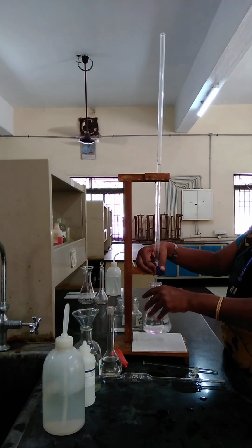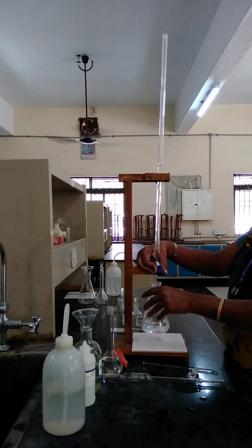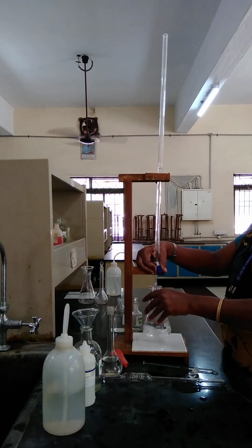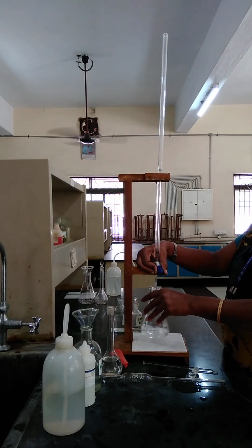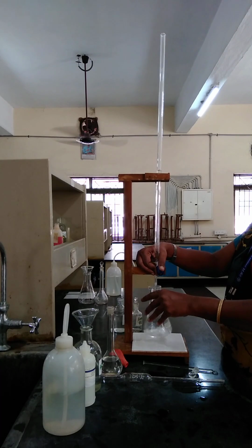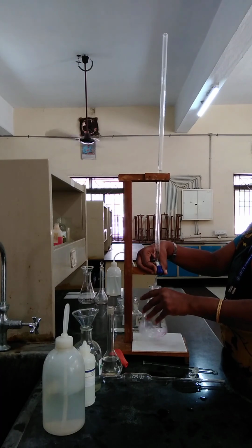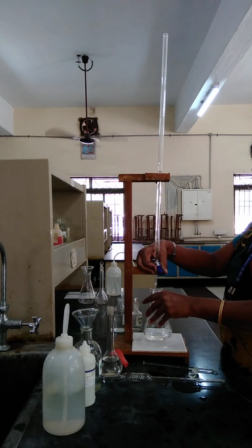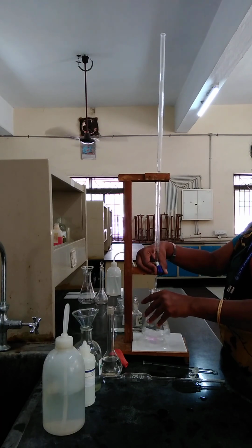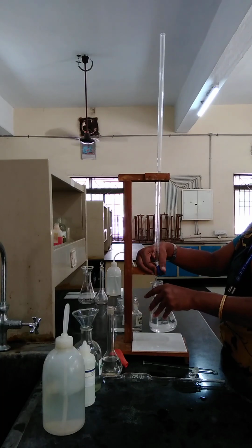If you add excess, once again we have to refill the burette, wash the conical flask, take the HCl 20 ml, add the indicator and then repeat. But without hurry, in the first 2 times itself we can get concordant values. That means successive titration values are supposed to be the same. So the waste of chemicals is avoided when you do the titration carefully.